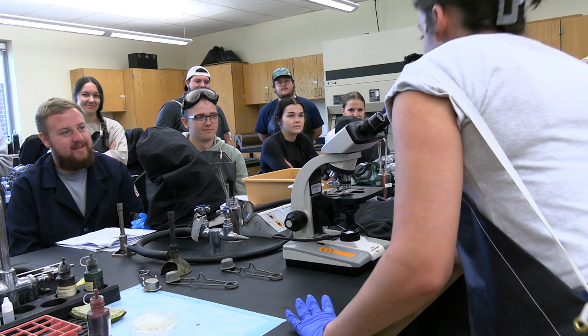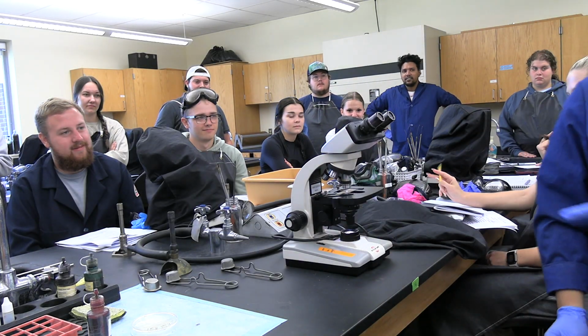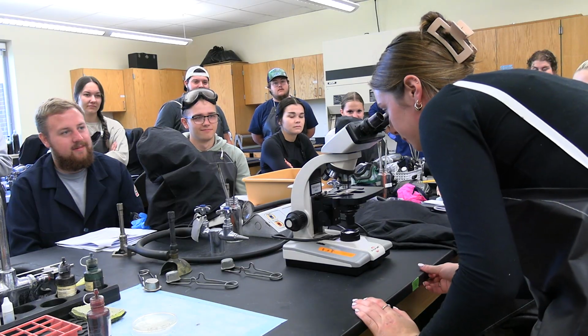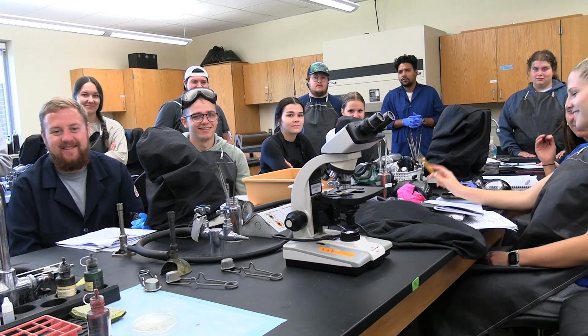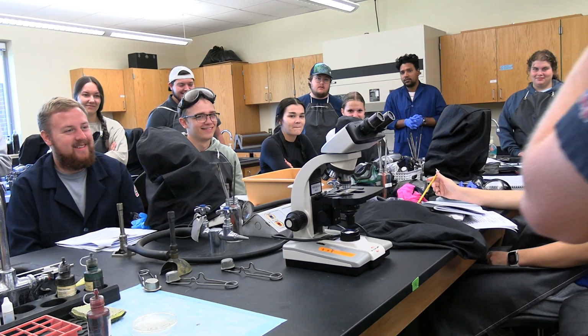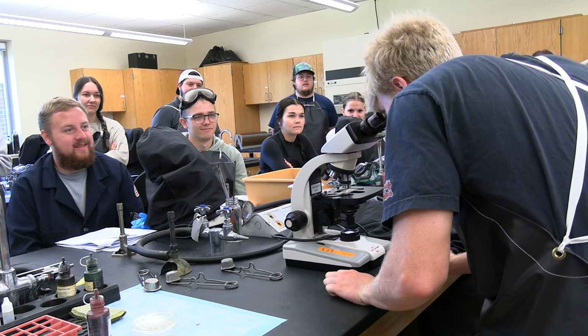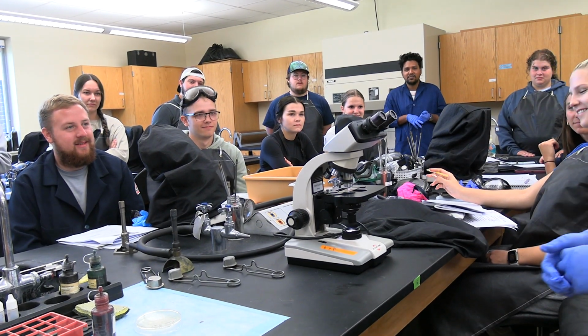Again, 3 representatives from the whole classroom. That's what 10x looks like. See it? Okay, come here to see it. What does it look like? Good. Yeah, but not very much detail. You do see a big chunk of bacteria there.